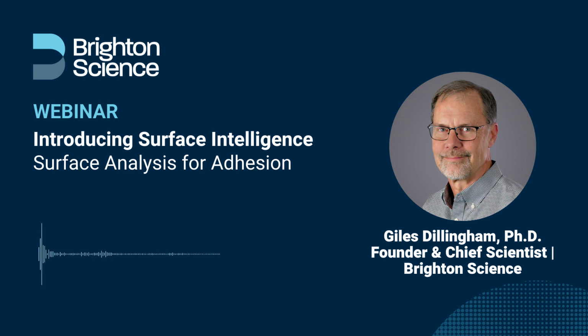Surface energy measurements via contact angles, right? This again shows us monolayer sensitivity, and it turns out this is a technique that's really indispensable for process development and process control, right? And this is a technique we're going to talk about at some length.